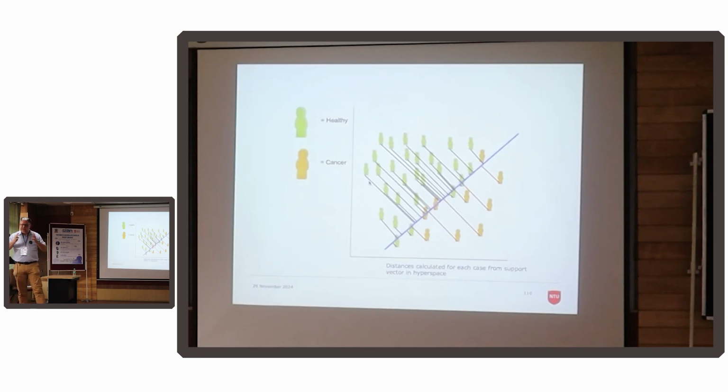So we're mapping out that data space and the line's position relative to it. Then the line moves and that's recalculated. The line moves, it's recalculated. So the line is moving through the space to make sure that the sum of those values is as high as possible and the sum of those values is as high as possible. So in that way, by compromising, the decision boundary is formed.